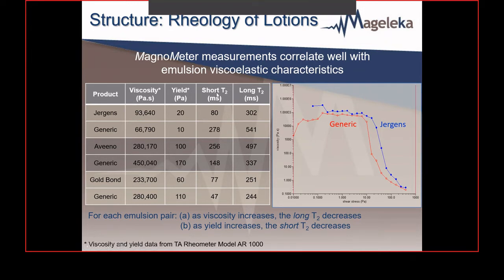There are 2 liquids. So there'll be 2 major intrinsic relaxations, a short time and a long time, characteristic for the total oil phase and for the total water phase, respectively. Now, by the total oil phase, I mean the oil phase with everything that's in it, not just the oil, and similarly for the water. And the table here summarizes the results of the relaxation and rheology measurements.